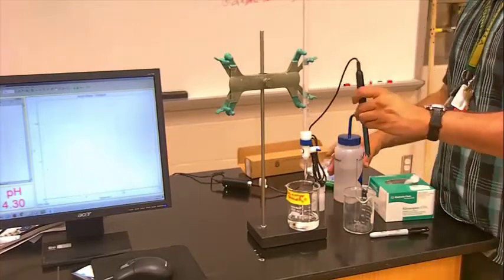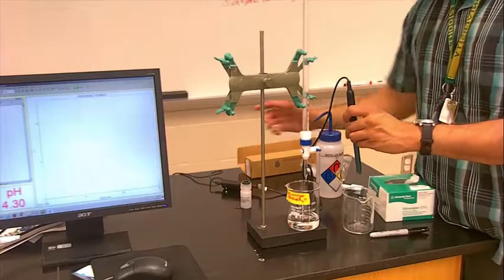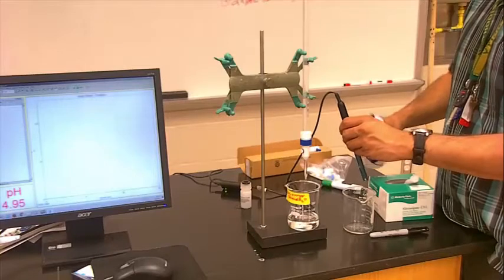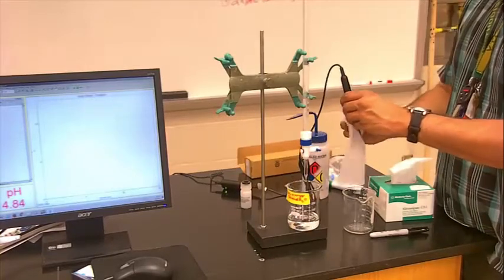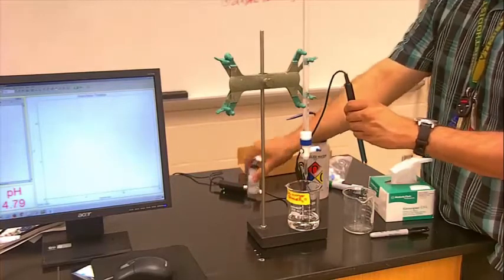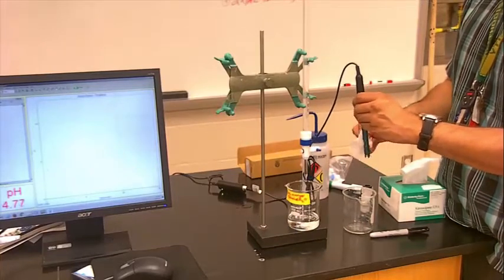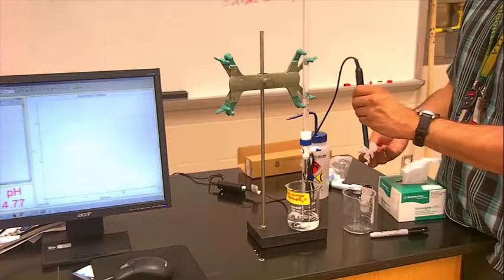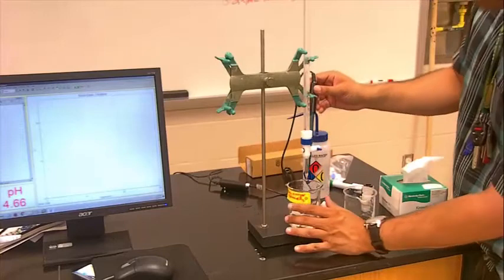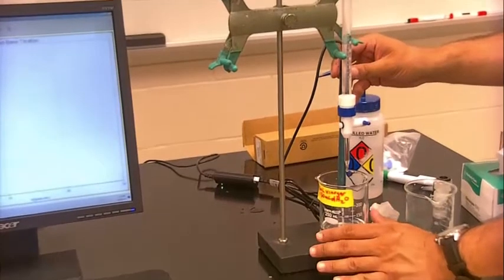There's the electrode. Do a quick DI water wash to make sure it's clean. This is what I like to do, wash it with some DI water. And then one good swipe with a Kim wipe to make sure it's dry, because that probe's been sitting in this electrode solution. So you want to make sure it's cleaned of all of that salt buffer. All right, so one healthy swipe, and you're going to put it in here. This is where you're going to get your partner's help. Two people would be very good.